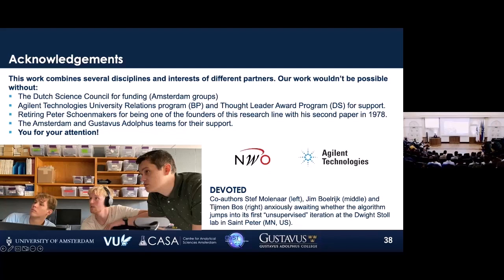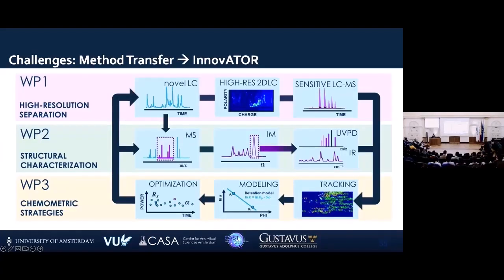Yeah, well, this is a huge issue, of course. So within one system, you can imagine that you do studies where, for example, you try to repeat a certain operation, for example peak tracking, over multiple days. But think about it: you have a site in Vlaardingen or Wageningen, and then you also have one in a different country. So it's actually one of our main objectives in a different project. It's an innovator project, which we do with a number of pharma companies.